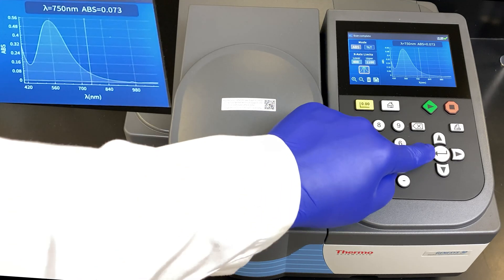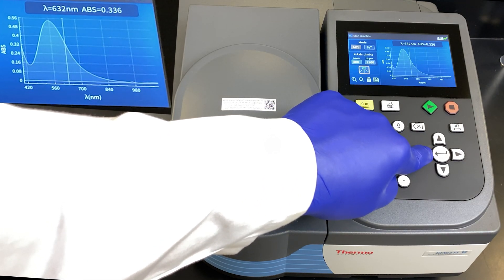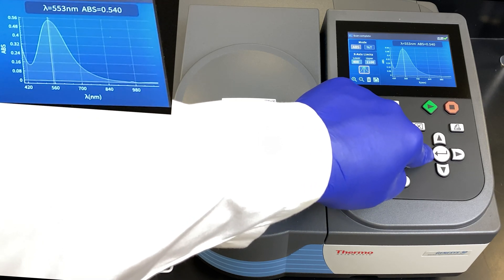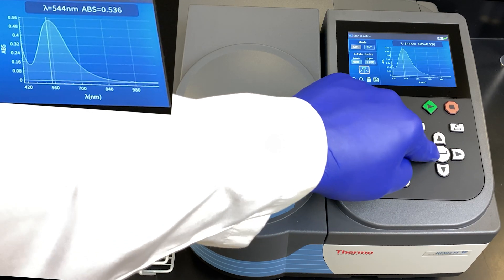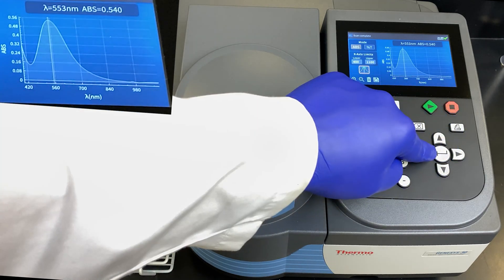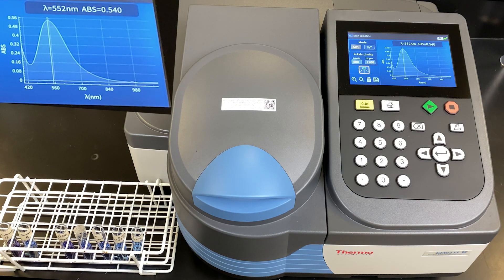Let's find the Amax by moving the cursor over. You can see we can move along wavelengths. The absorbance is going up. 0.540 appears to be our maximal absorbance. Let's find the exact wavelength. Move the cursor back and forth. It appears 552 nanometers is the Amax for this particular sample.